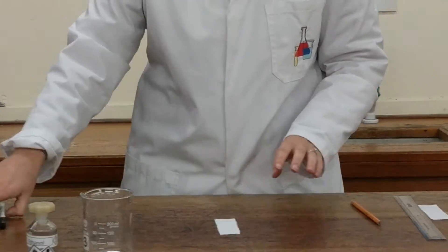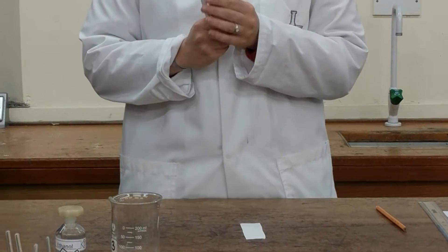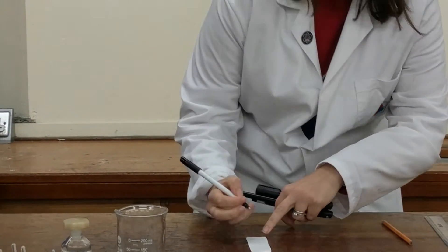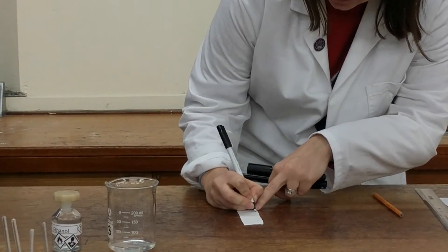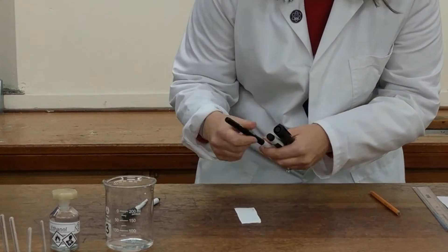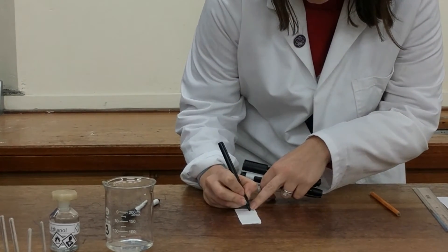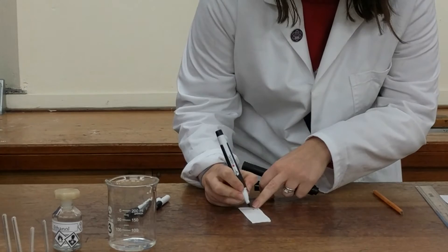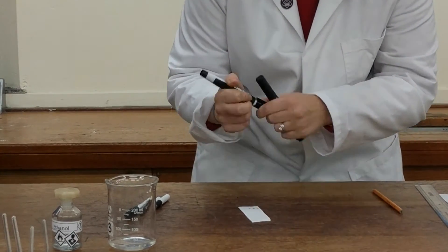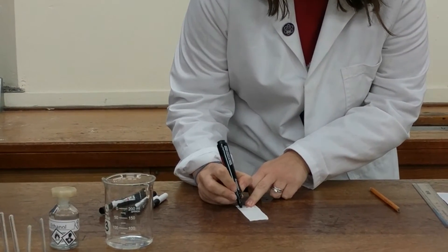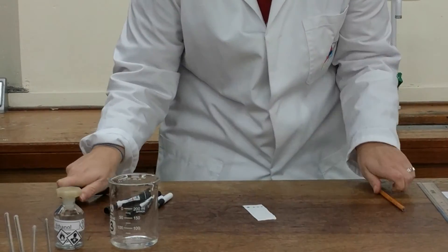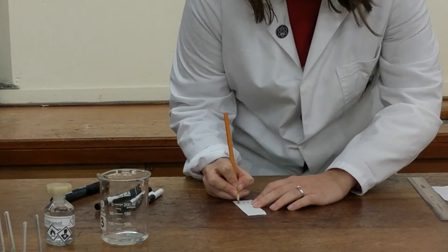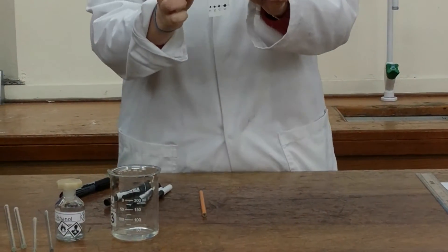On that line we're going to test four different black inks today. I'm just going to call them A, B, C, and D. So on the line you will put just a dot of each one, quite evenly spaced, otherwise they will merge into one another. And I will entitle them A, B, C, and D along the bottom.